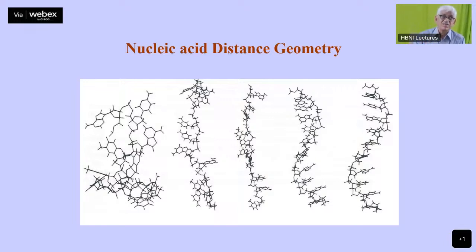It's called torsion angle based distance geometry, TAND. It is also called distance geometry. You start from an arbitrary model for a particular DNA sequence. This is a 12-mer DNA. It is an arbitrary model, anything, and there will be all kinds of clashes.